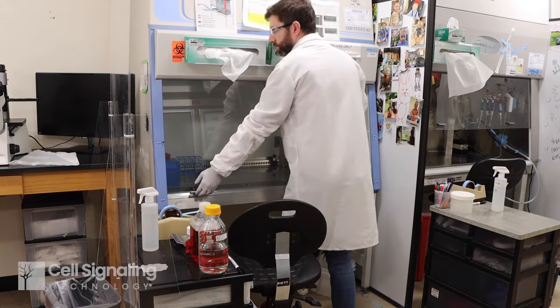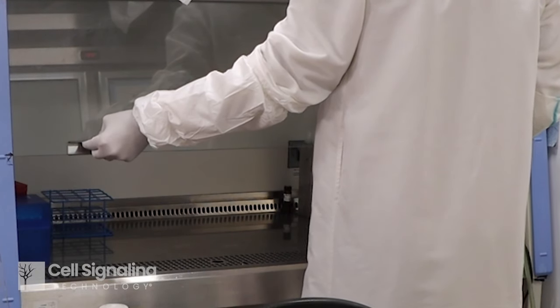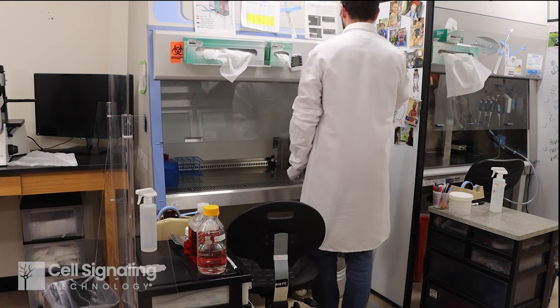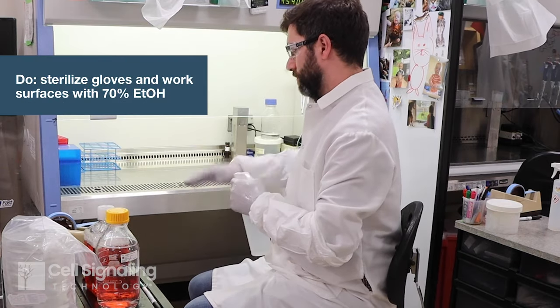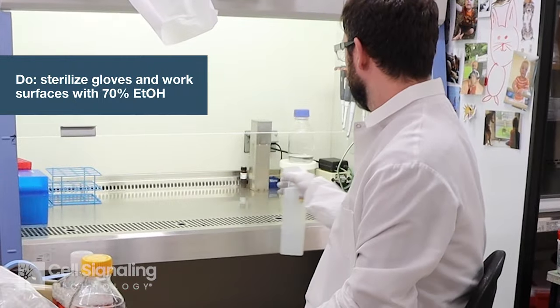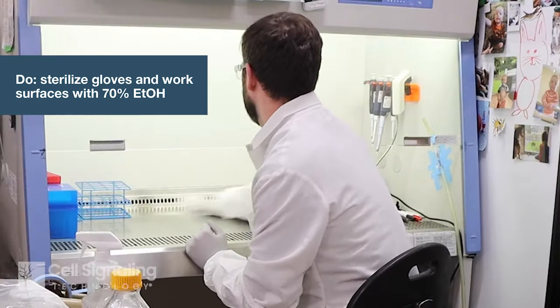Turn on the cabinet lights and air filter, adjust the glass sash height to the specified mark, and run the filter for at least 15 minutes before starting any work. Use a spray bottle to apply 70% ethanol to your gloved hands, then spray the interior of the biosafety cabinet and wipe with lint-free wipes or paper towels.